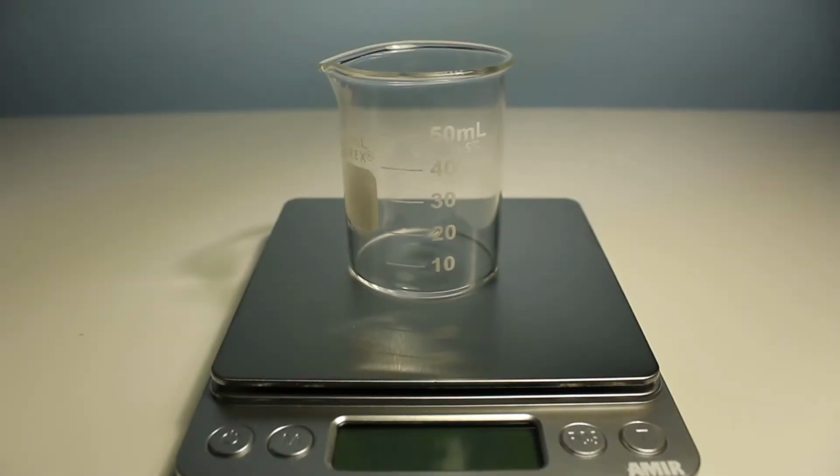Now it's time to measure out the ingredients. But first, of course, if we're going to do a reaction, we need a vessel for the reaction. And in this case, the solvent is going to be pure water. For the amounts for each ingredient, first, pure water, 125 grams. Next, sodium bicarbonate, 97 grams. And last but not least, anhydrous citric acid, 74 grams.